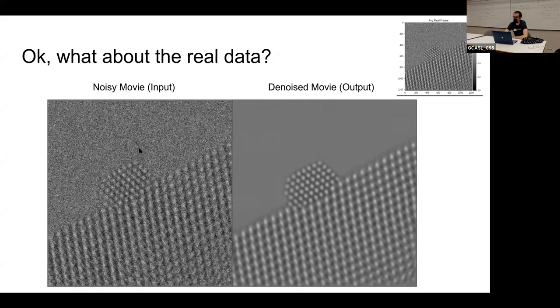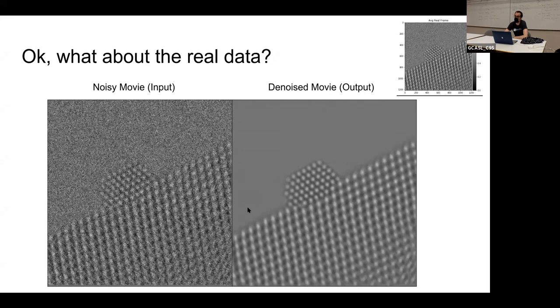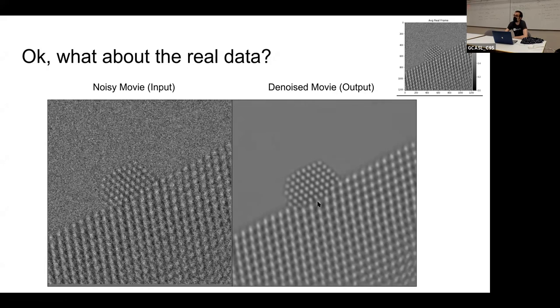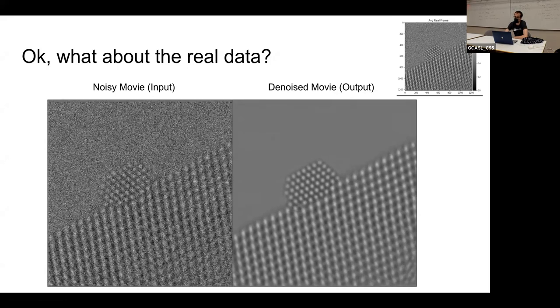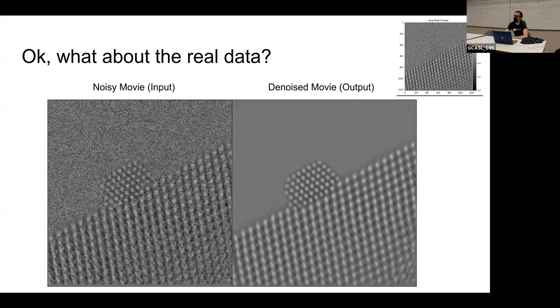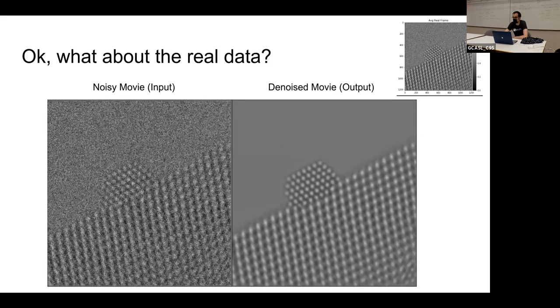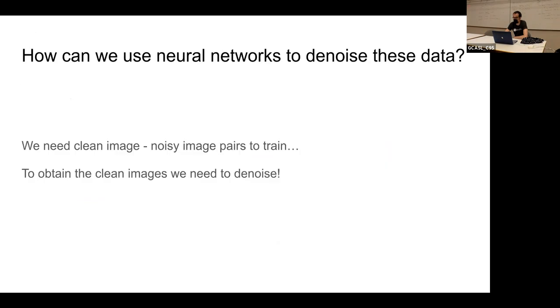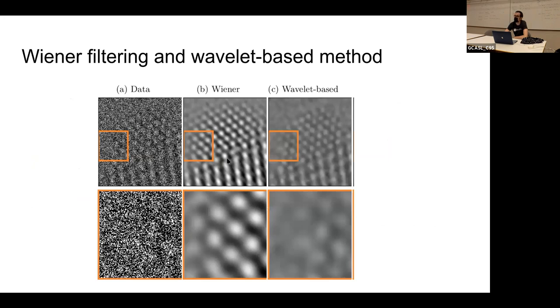In any case, for them, it's actually super important to have good denoisers, because otherwise they would be fooled by the noise when they're just looking at the data. They spend a lot of time looking at the data. So having something that actually removes noise is very useful for them to figure out how things are going. But you're completely correct. At the end of the day, what they really would like is, how is the 3D structure of the nanoparticle changing? But let me remind you what they actually look at often. They look at images that are denoised with Wiener filters. They would look at things like this. I mean, this is complete garbage with respect to what the neural network actually outputs. But even stuff like that is kind of useful for them, because they see the periodicities and they can be meaningful.